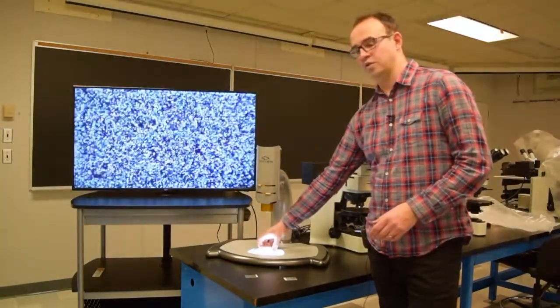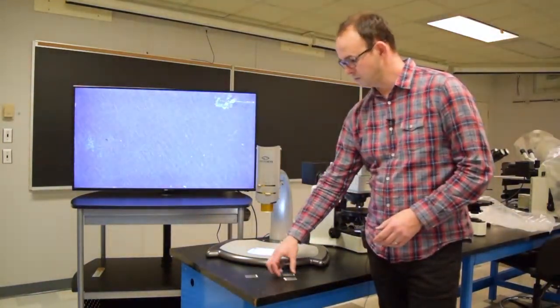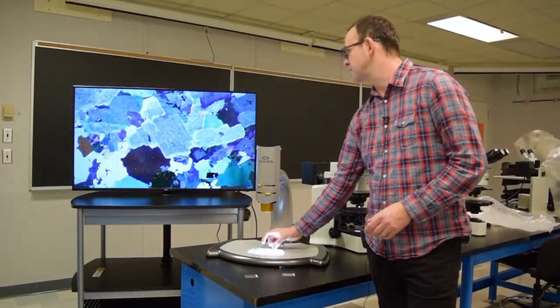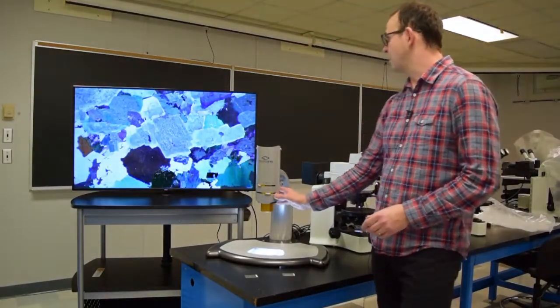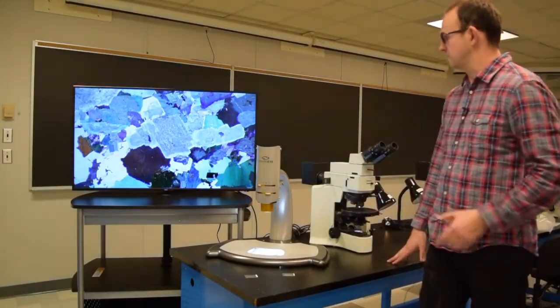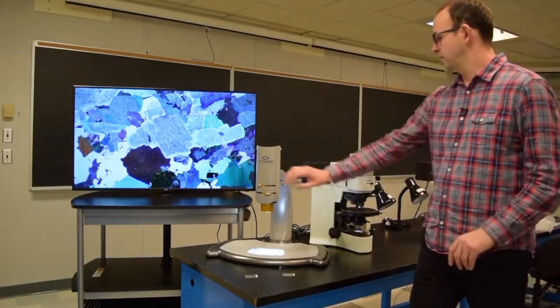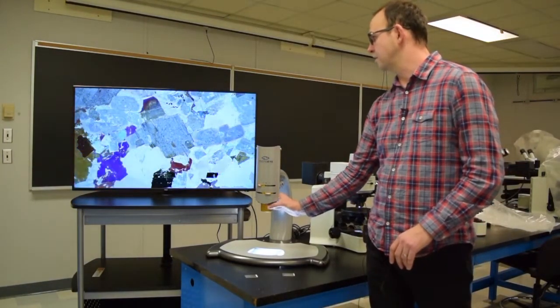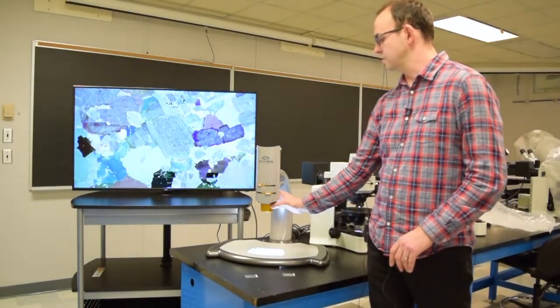This is a sandstone. You can see all the sand grains. Here we have a granite that has larger grains, an igneous rock that crystallized slowly. We can see the different types of minerals depending on the different colors that are produced under the scope.